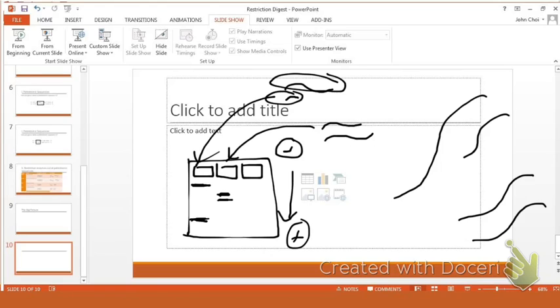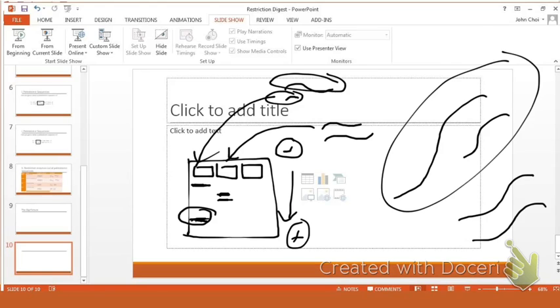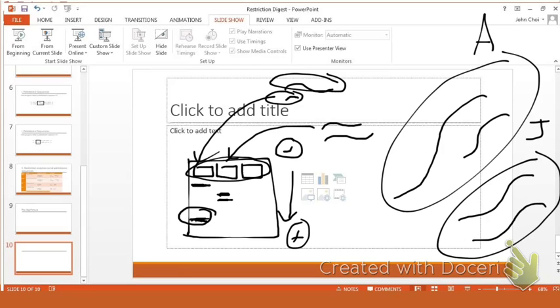Which of you two do you think is going to see a band pattern further beyond the wells? So if this is Adelina and this is Jenna, who is going to show a DNA pattern that's further away from the wells? Adelina, because she has a smaller DNA fragment, and that's going to travel further down the line. Okay? So that's basically how we can do it.